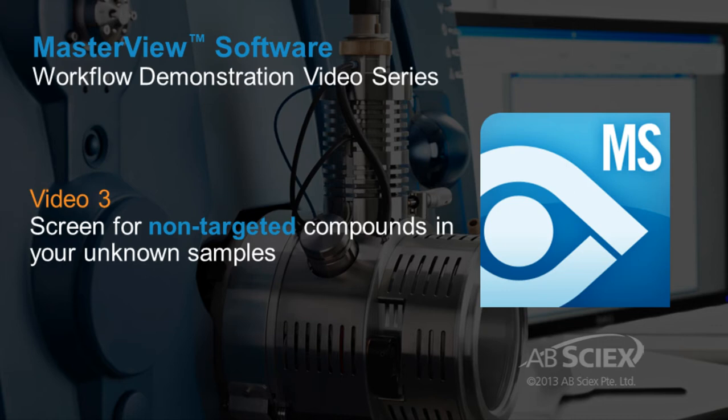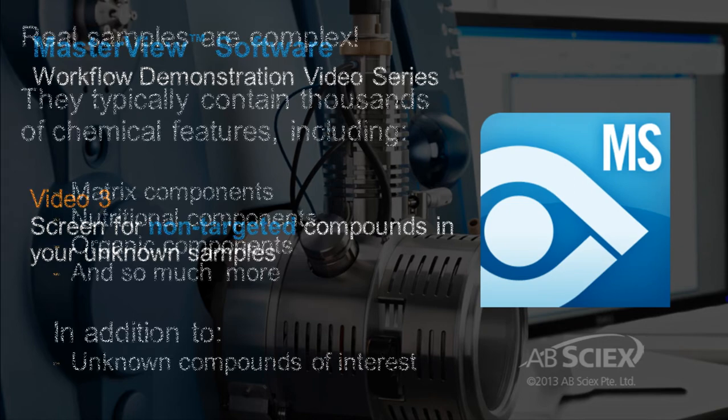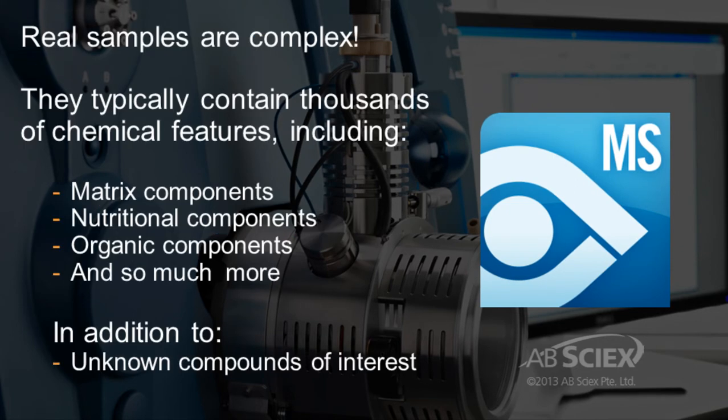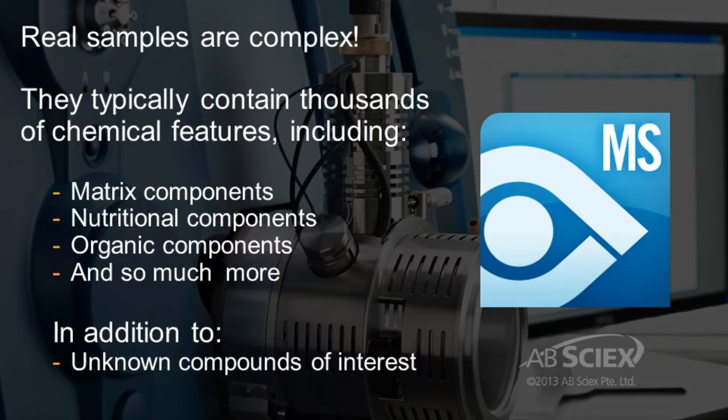Performing unknown surveillance or non-targeted screening to find relevant compounds, contaminants, or residues in your unknown samples can be a huge challenge. Especially since samples contain thousands of chemical features and characteristics that must be analyzed and sorted through to find any unknown or unique compounds that are of interest.